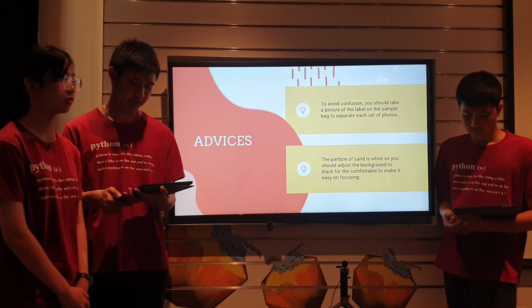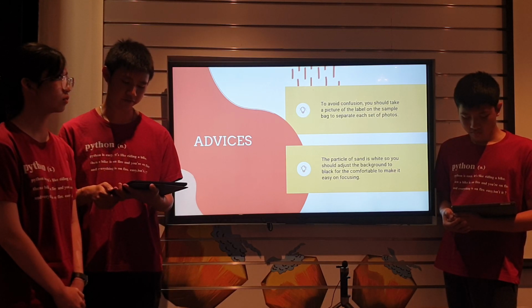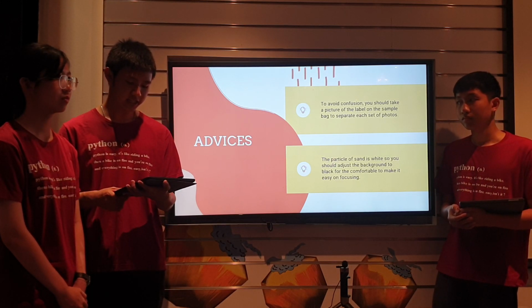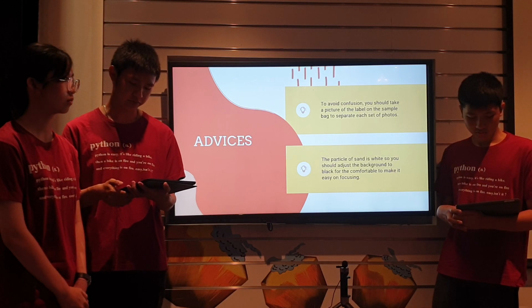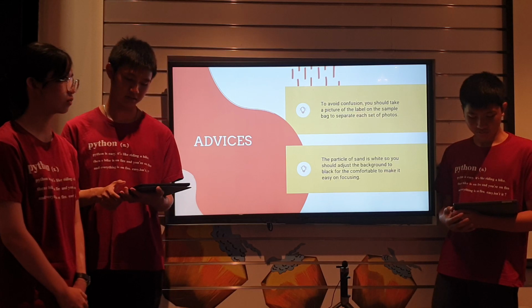Here is some advice. To avoid confusion, you should take a picture of the label of the sample bag to separate each set of photos. Secondly, the particles of sand are white, so you should adjust the background to black to make it easier to focus.